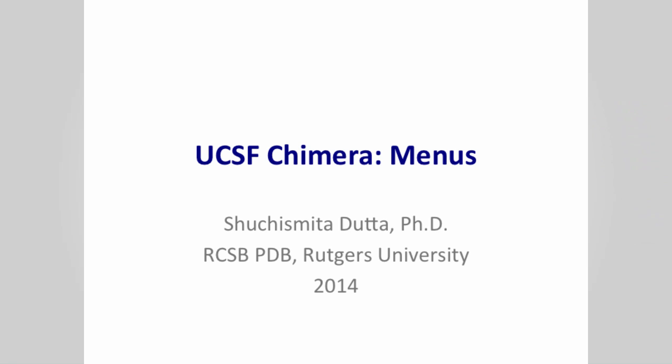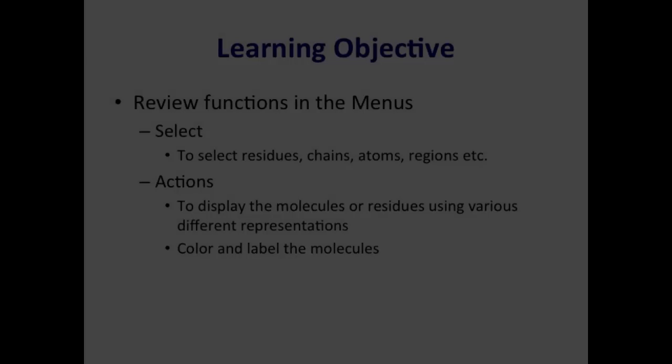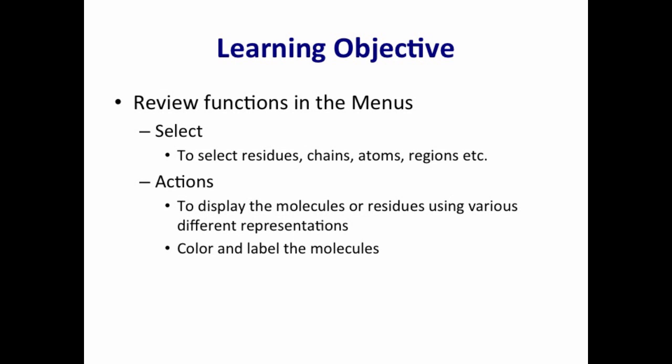Hello and welcome to the UCSF Chimera menus tutorial. In this tutorial, you will learn about two specific menus of the software, Select and Actions.